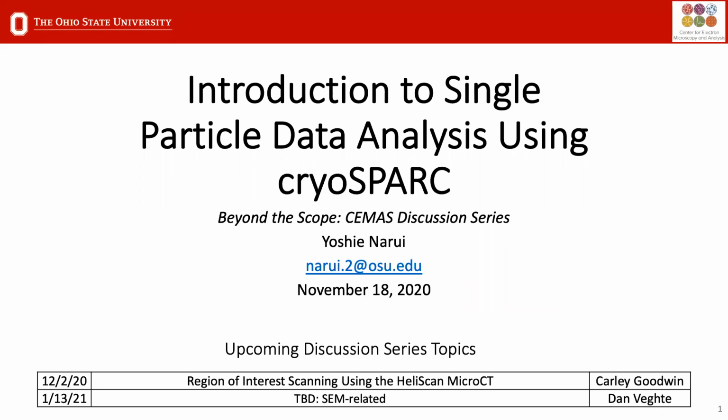Okay, so now I'm in the proteasome project, and it has at least 2 different workspaces here. So you'll see there's workspace 1 and 2. In workspace 1, I've already gone through all of the steps that were outlined in the tutorial. And workspace 2, I've just created as a live demo.